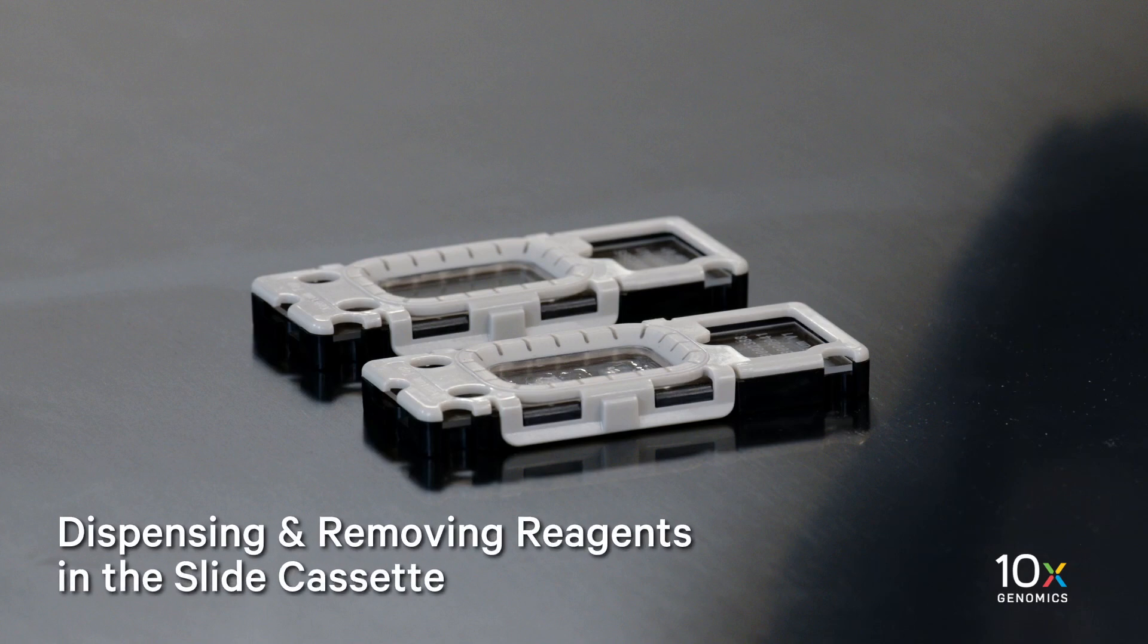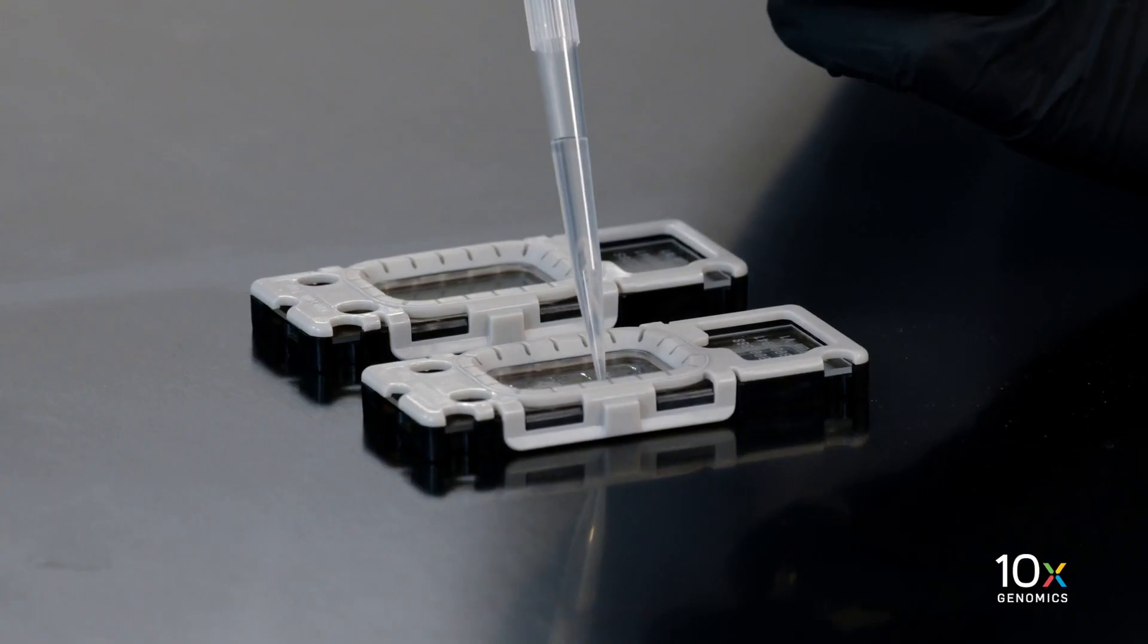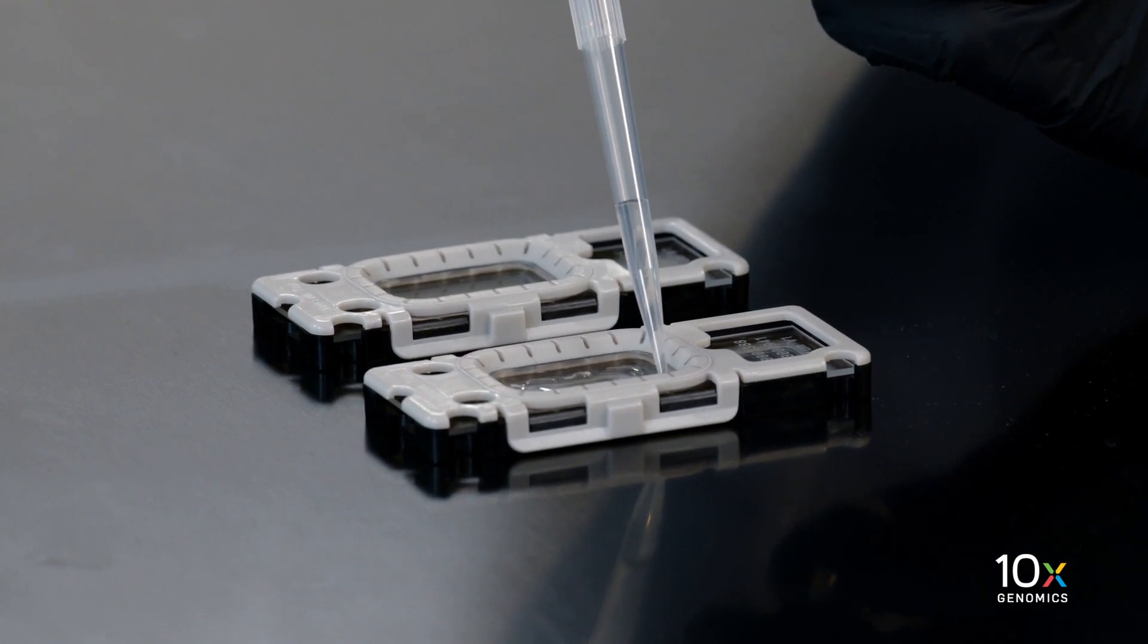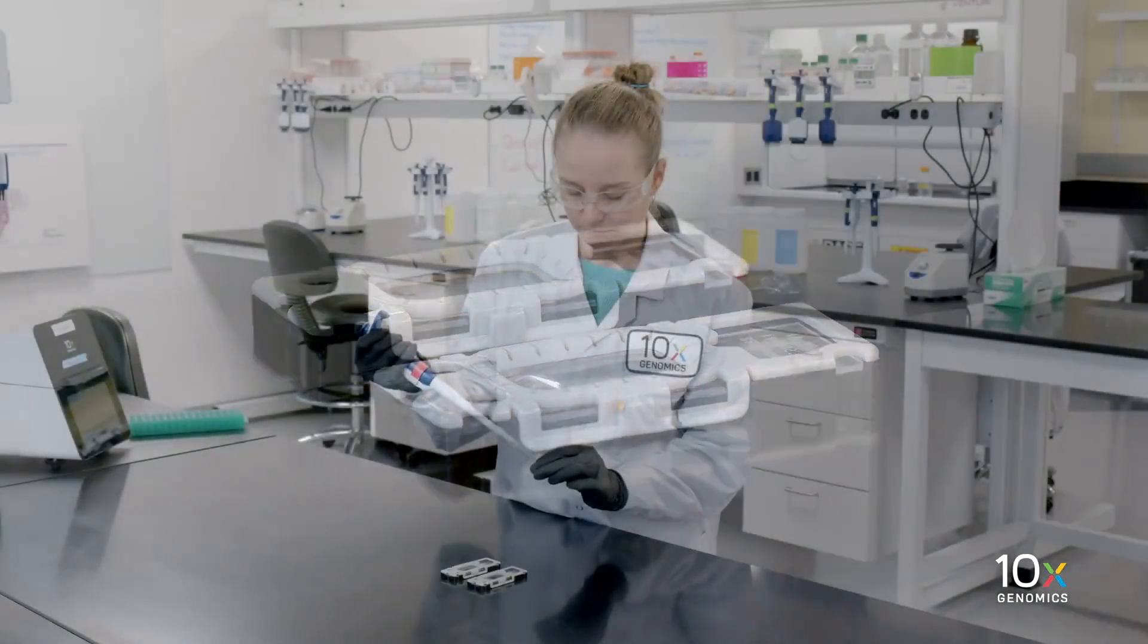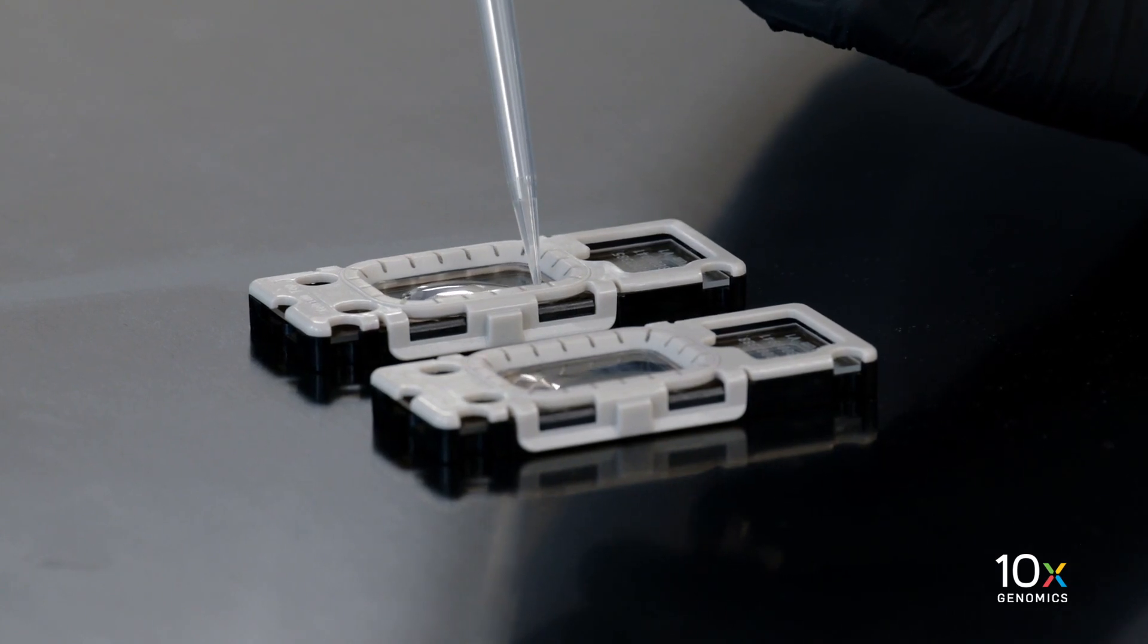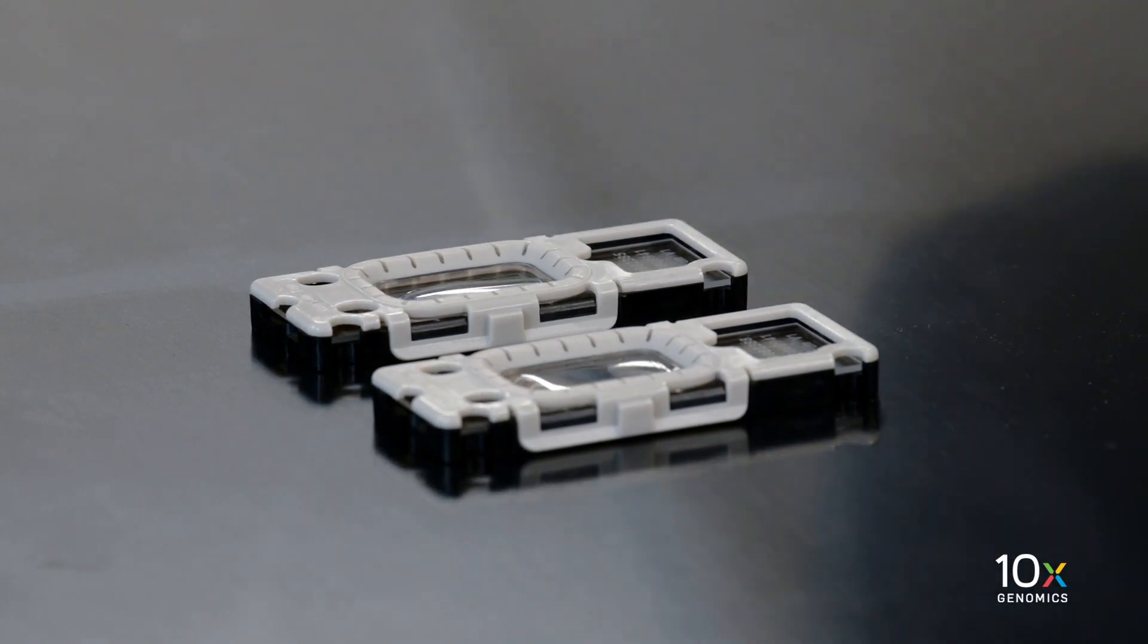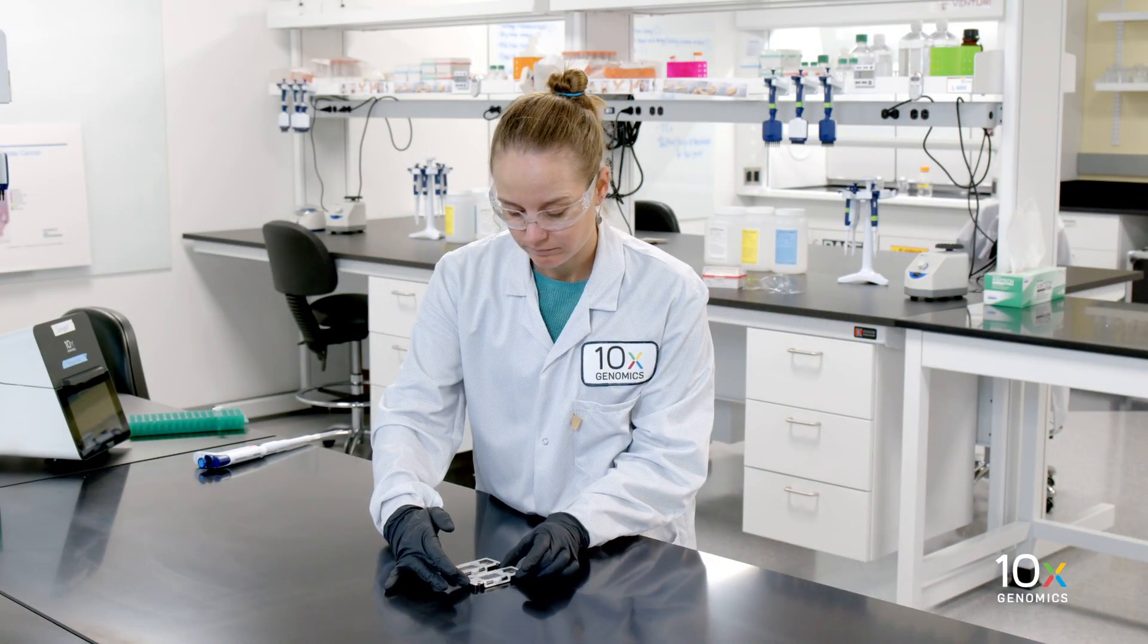Next, we will demonstrate dispensing and removing reagents in the slide cassette. After the slide cassette is assembled, we can dispense reagents into the well. Dispense and remove reagents along the side of the well without touching the slide surface, tissue sections when applicable and without introducing bubbles. Always cover the sample area completely when adding reagents to the well. A gentle tap may help spread the reagent more evenly.